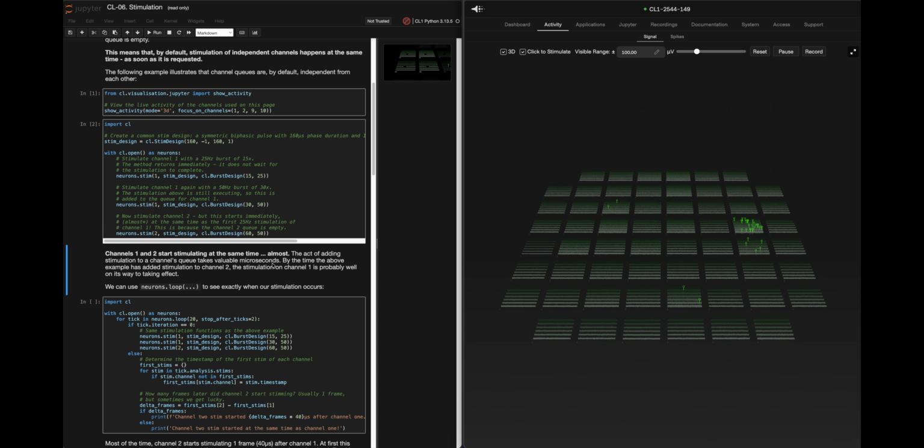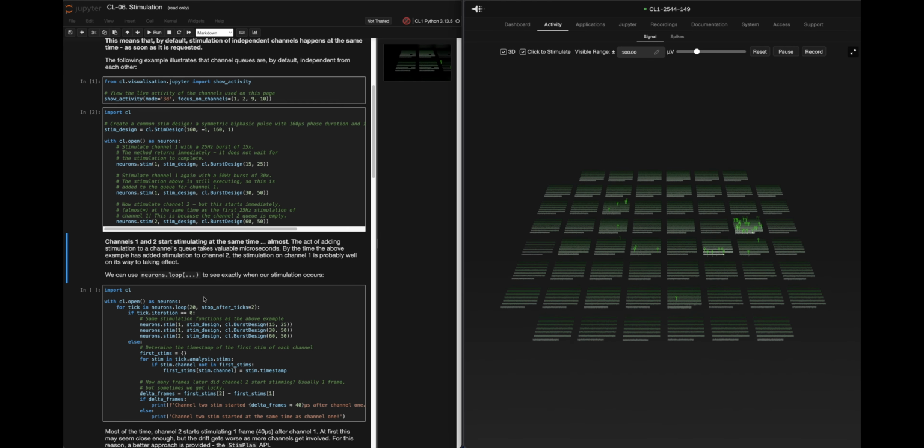You basically burn your culture out just to play a game or just to do a short task, which, considering the cost that goes into these, you do want longevity. You want something that's going to last more time, that's going to be meaningful to a longer scope mission. So just something to pay attention to.